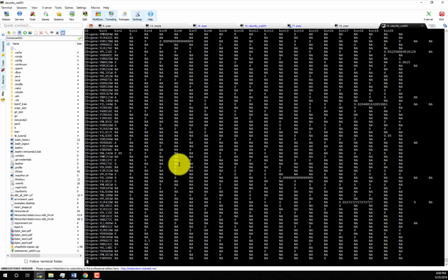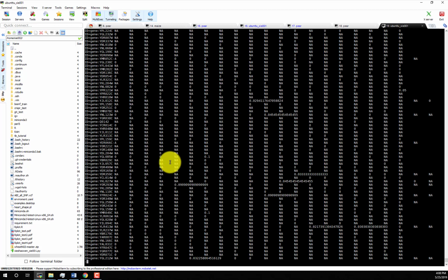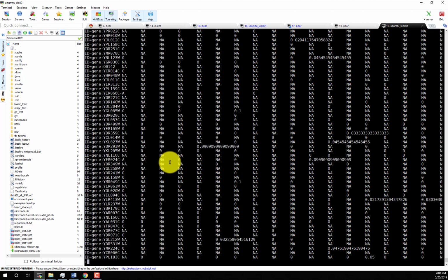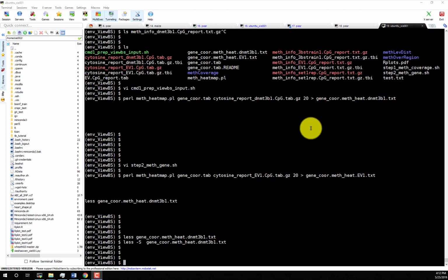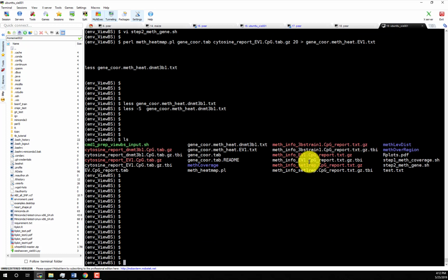But basically, we see here we have lots of NA. So I don't know whether this is a good way, whether this is because we have very limited reads, or because of other things. Let's see. Okay, let's try the other sample, DMT3B.